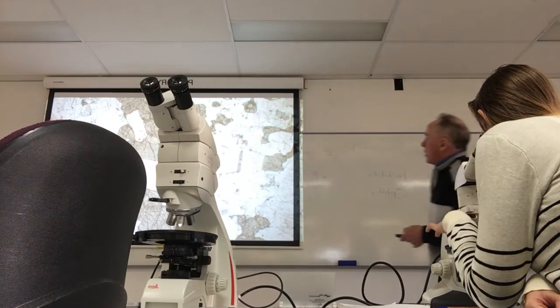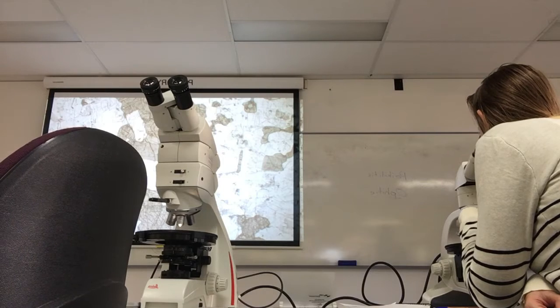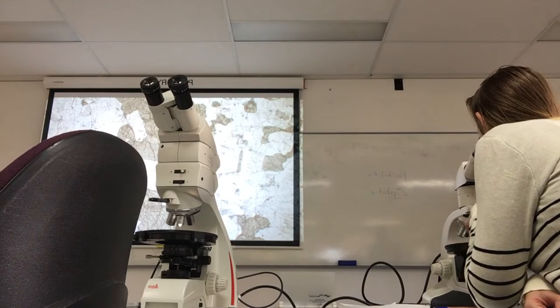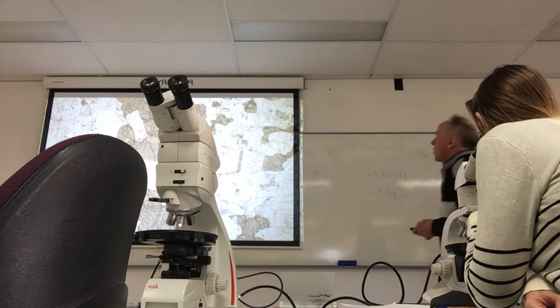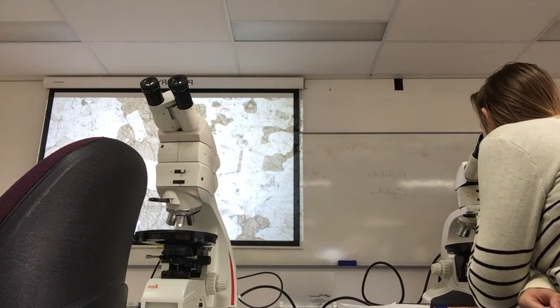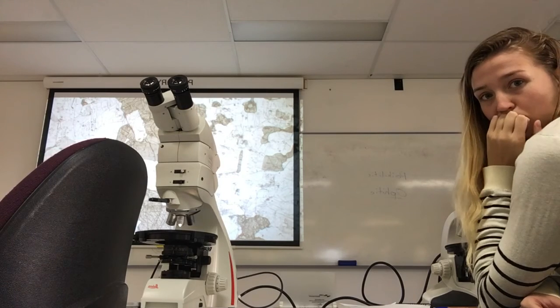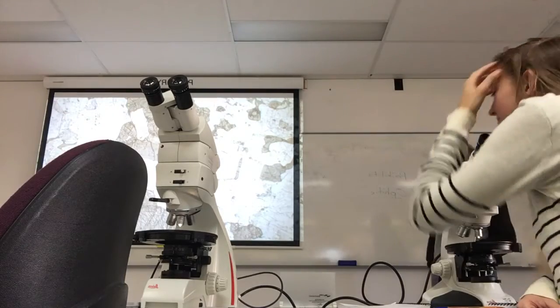I won't go into specific minerals. There's a couple of key things, both the presence and an absence of a couple of minerals in here, which are a bit telling, but I really wanted to talk about the pyroxenes because they've got quite spectacular exsolution textures. And we talked about exsolution in pyroxenes in the lecture. So these things are probably quite high temperature.